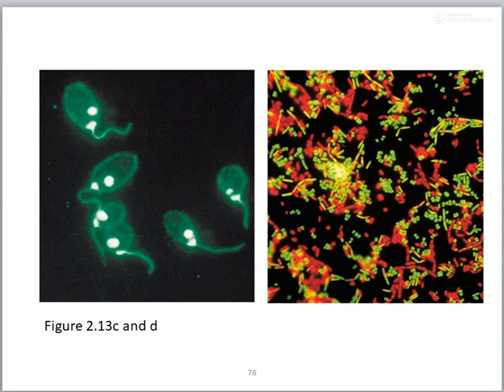Now, if you look into this picture, you can see that the specimens which are being viewed under this microscope are being found to be fluorescing, and they are having different colors. You can see green color in one, and in another specimen which has been viewed, you can see red color as well as light green color also. And they are fluorescing against a black background. Now, what is fluorescing? Fluorescing is emitting a particular wavelength of light and becoming colored.